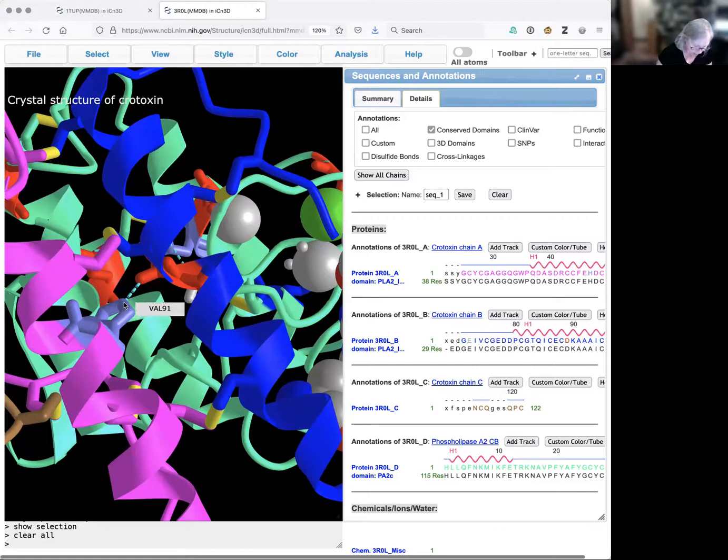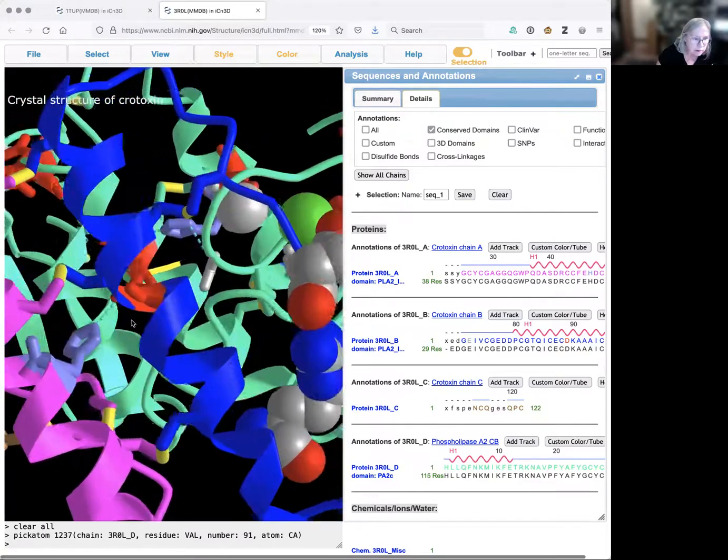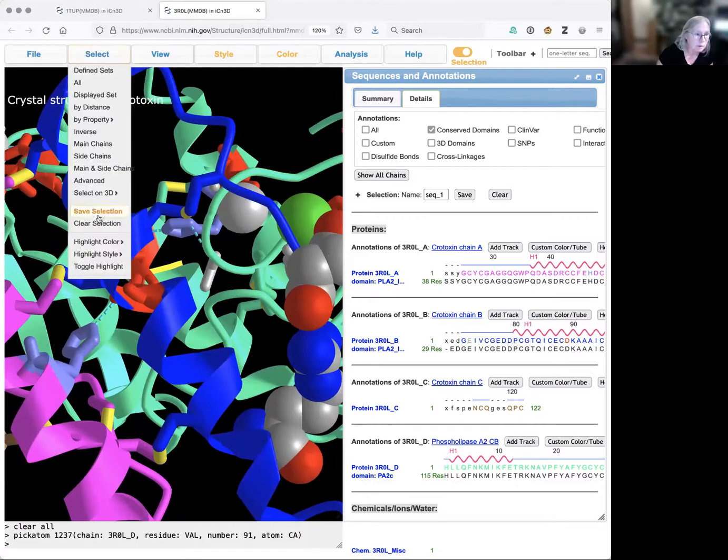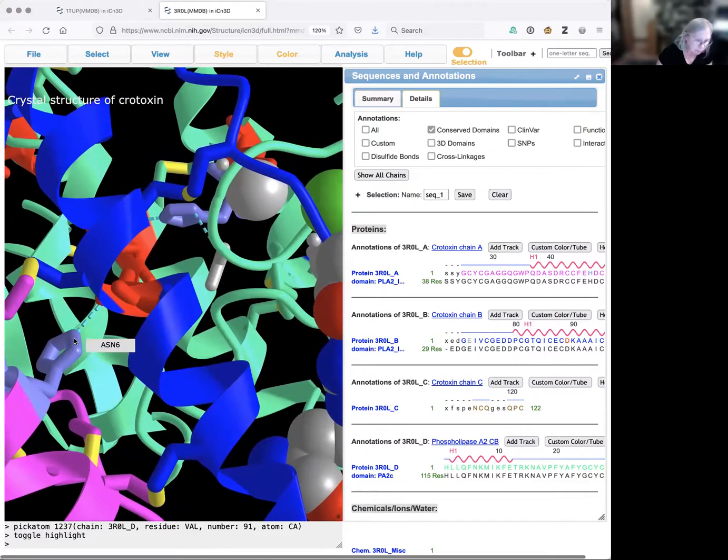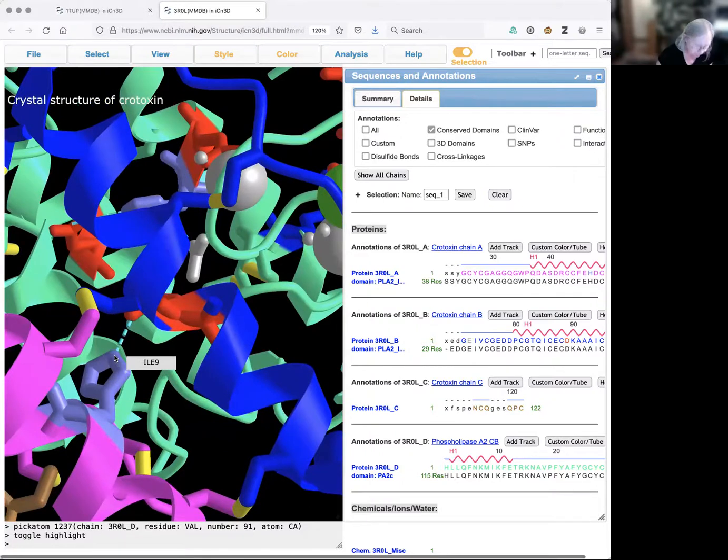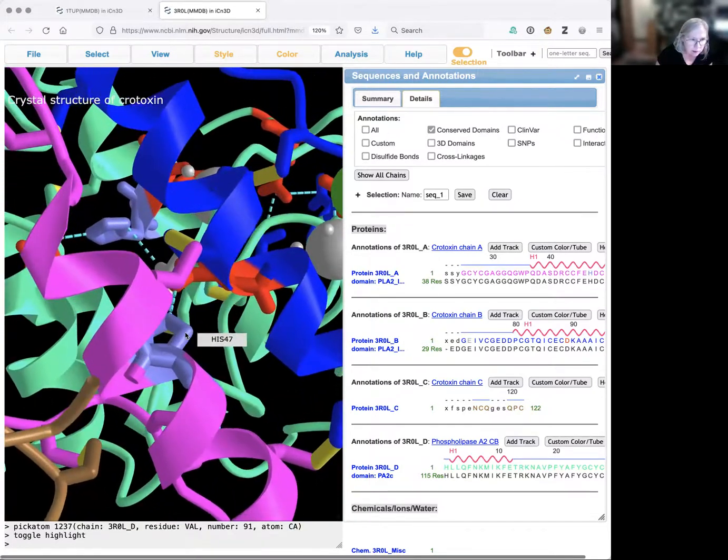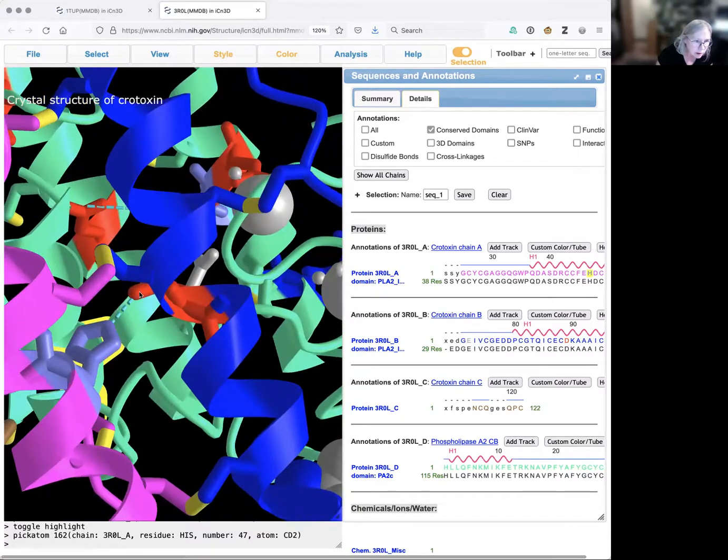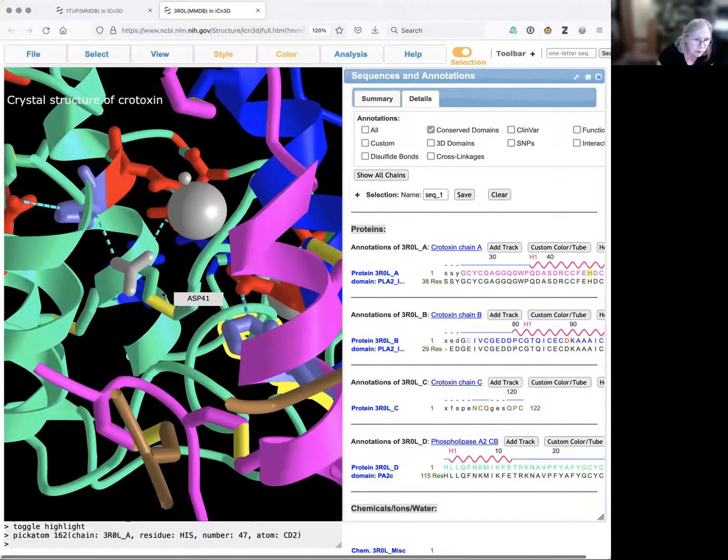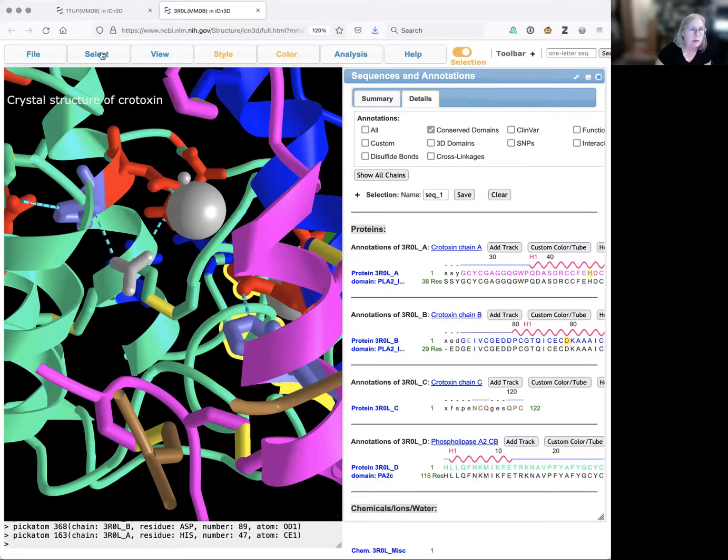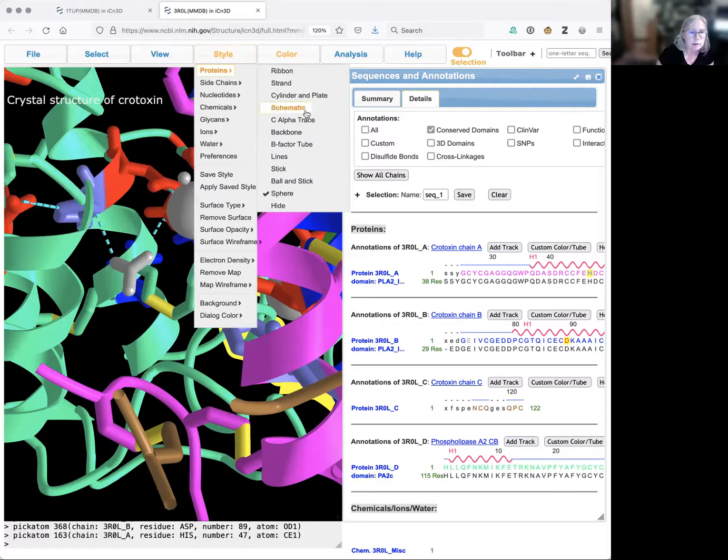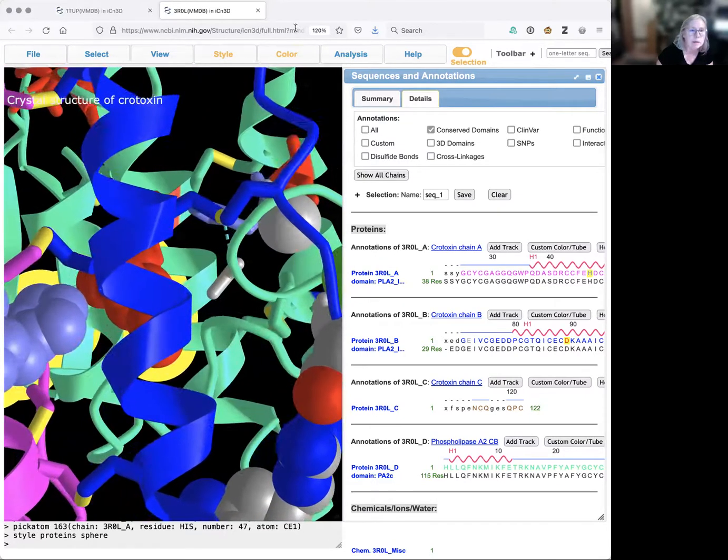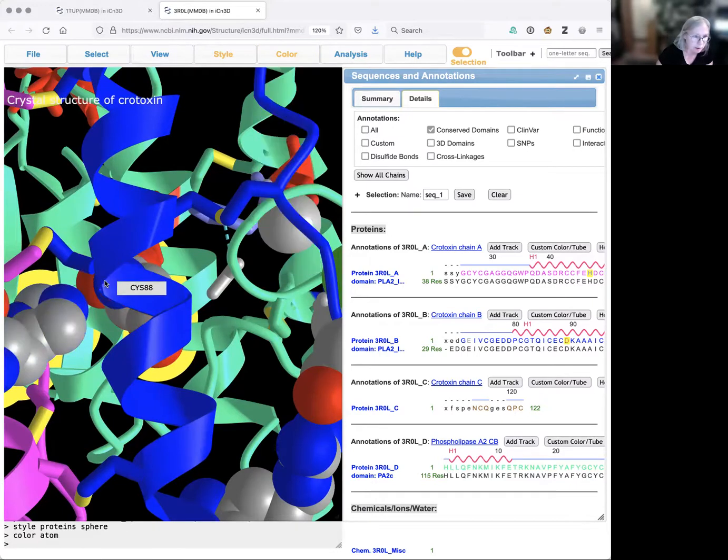I'm going to select that histidine. I'm going to toggle the highlight and try again. And I'm going to select the aspartic acid that it's interacting with. Now I'm going to take these and make them sphere, and I'm going to color by atom so you can see the atoms that are interacting.